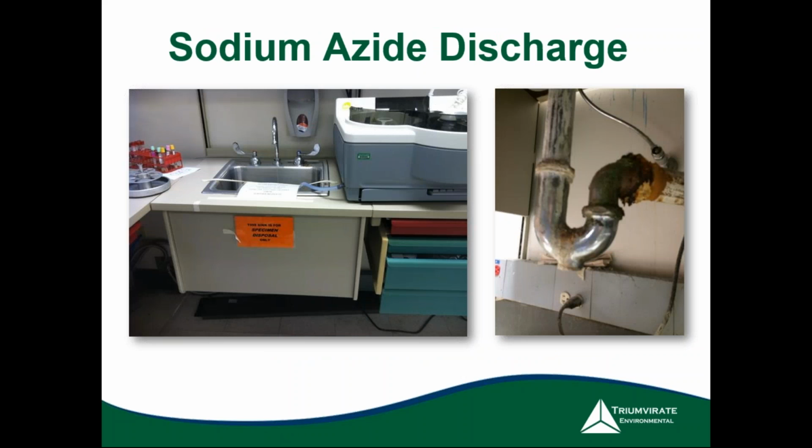So this is just a photo of one of the experiences that I've had with sodium azide being discharged into a drain system. You can see that that's the effluent of the machine just going into the sink. And then that's a photograph from underneath the sink. This was actually at a client site where an explosion had happened. You can see that in the tail end of the sink and the sink trap, there's quite a bit of accumulation of what appears to be salts, and it just doesn't look good. There's a reaction going on there.